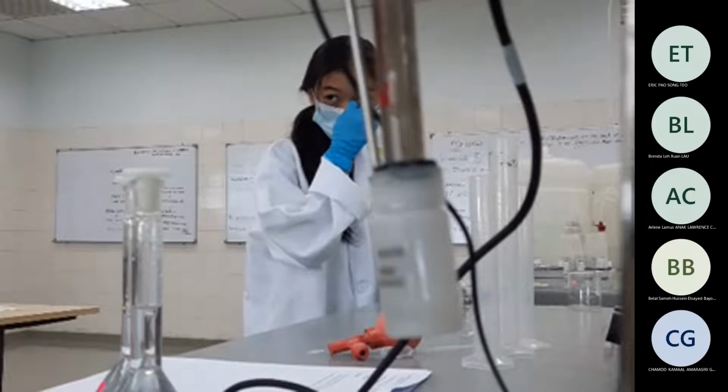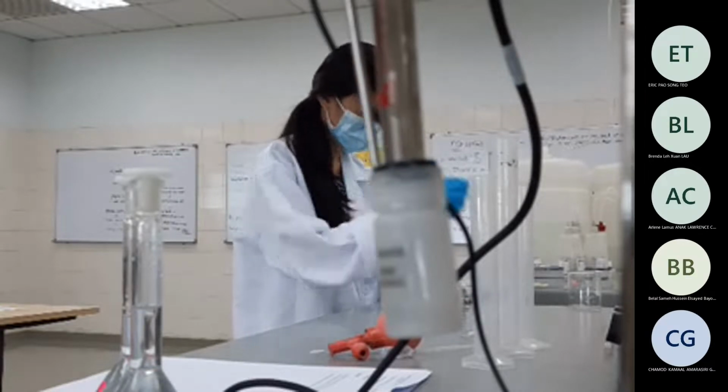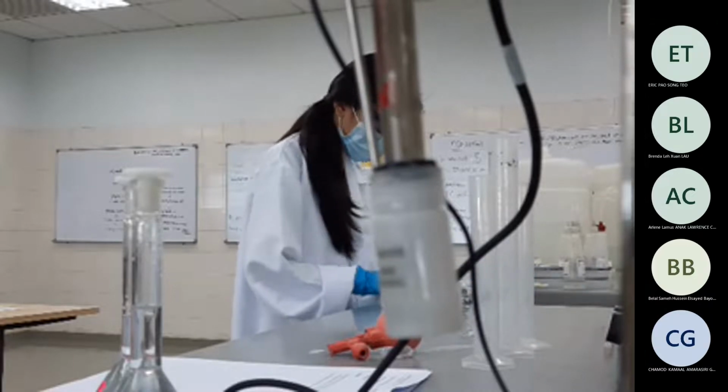They look the same size, but the calibration mark is different. Oh, one is a bit fatter, one is a bit thinner. I can't actually see whether it's, yeah, inside, you have to see the inside.